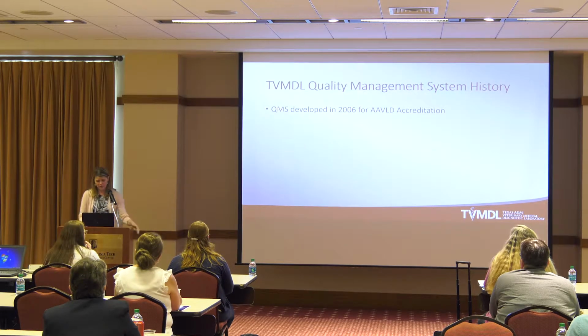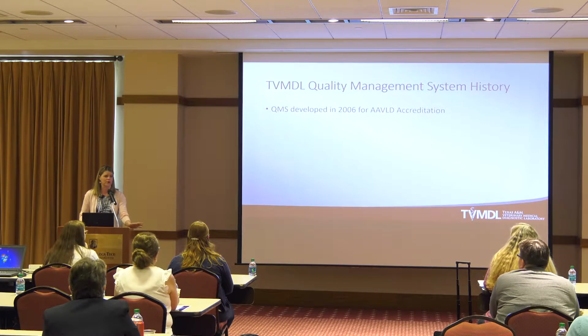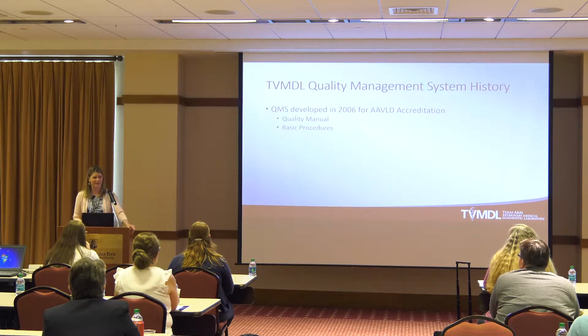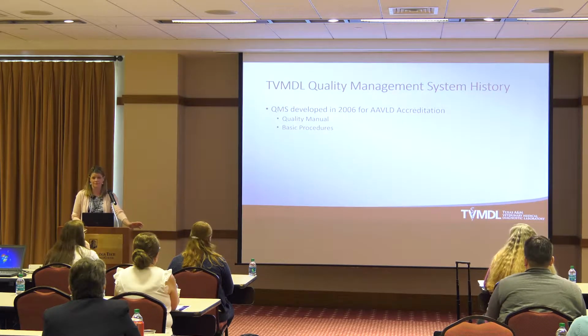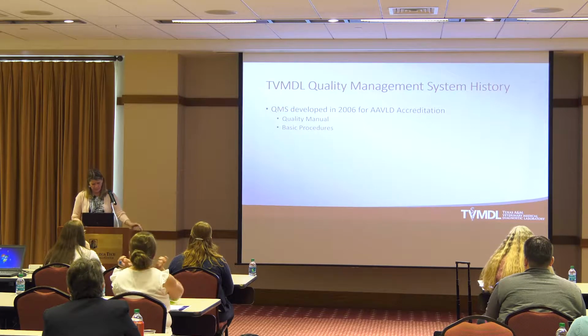A little bit about our quality management system history. So about in 2006, we developed our quality management system for our initial AAVLD accreditation. It was a basic quality system. You had a quality manual and some basic procedures that said basically you have to follow our procedures, right? So had the quality manual, you had the procedures that say follow procedures, and we basically have evolved from there.